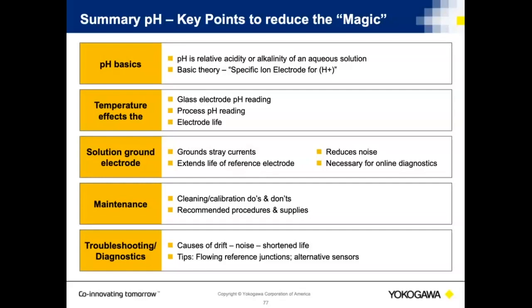Temperature also affects the electrode life. Solution ground: I always want a solution ground in solution. Number one, to basically get rid of any stray currents, but also to reduce noise and allow me to make some significant online diagnostic measurements.